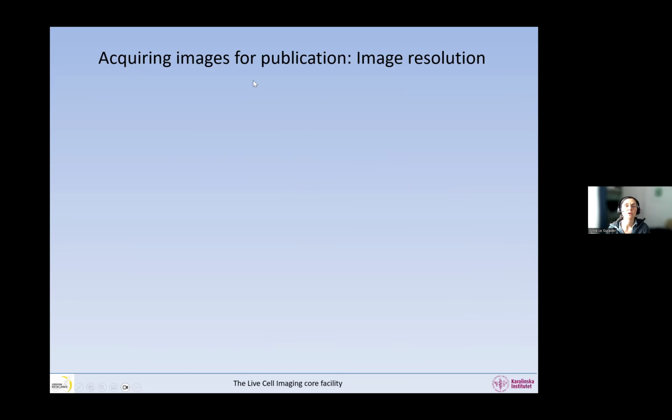Another aspect is the image resolution. As we know, the image resolution is either the optical resolution delivered by the microscope or the digital resolution, whichever is limiting. We use different resolutions for different purposes. We need to acquire the image at the resolution that is needed to extract reliable data, not beautiful images. So please get away from trying to acquire the best, the most beautiful images. What we want is to extract reliable data.